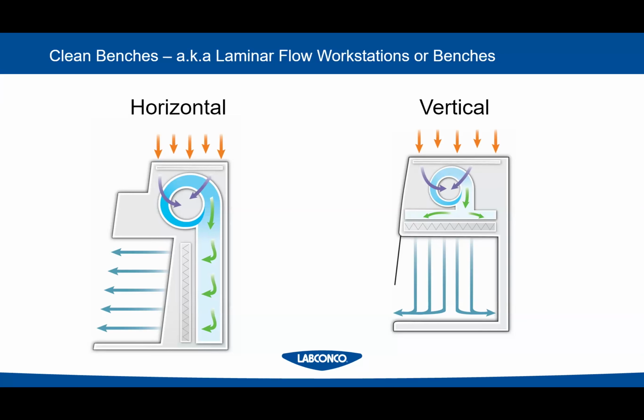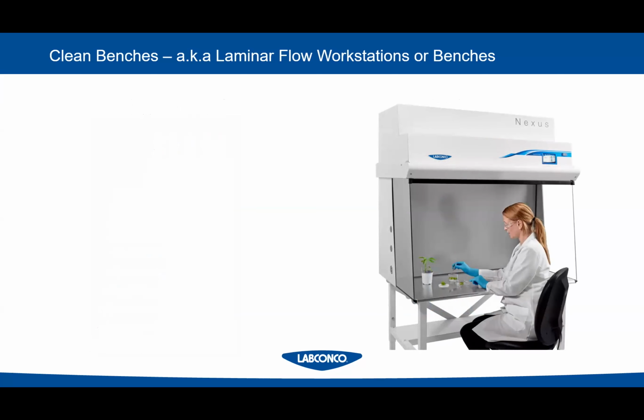These are great for plant research, right? Because a lot of times my plant seedlings, they're not harmful. They're not going to hurt me, but I don't want any dust or mold or bacteria in the air getting into my soil or my media, right, to contaminate them. And then we have vertical clean benches. Again, room air comes in the top, the blower pulls it through, pushes it through a HEPA filter, and you have this nice, clean, what we call ISO 5 environment or sterile environment.